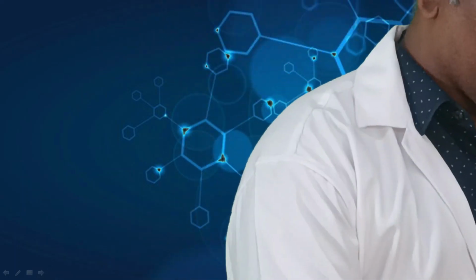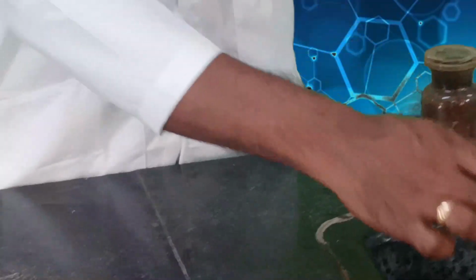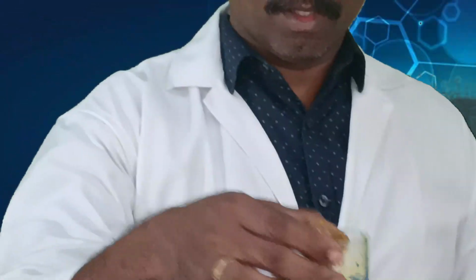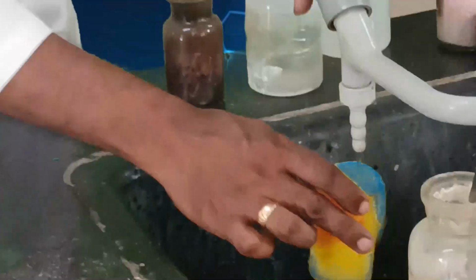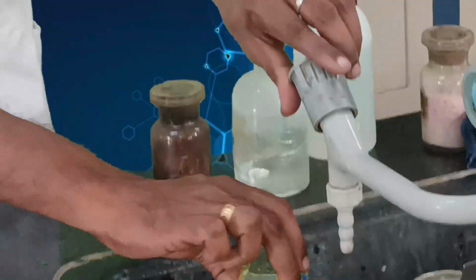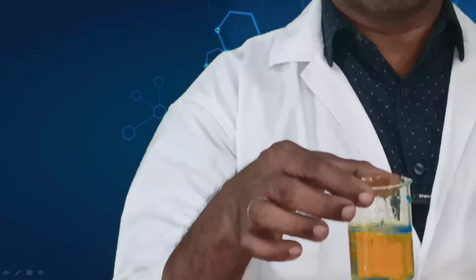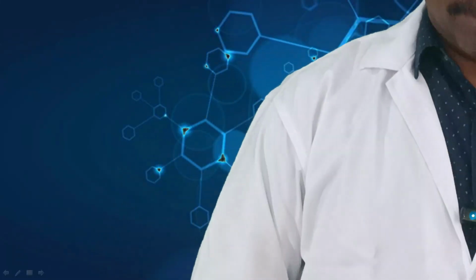The beauty of this experiment is, if you dilute the solution more and more, you will get a more beautiful color. Okay, if you dilute more and more, the color will not fade away. Okay, you will get a beautiful greenish yellow color. Okay, this shows the presence of dicarboxylic acid. If you don't get this fluorescent yellow color, that means your compound may be monocarboxylic acid.